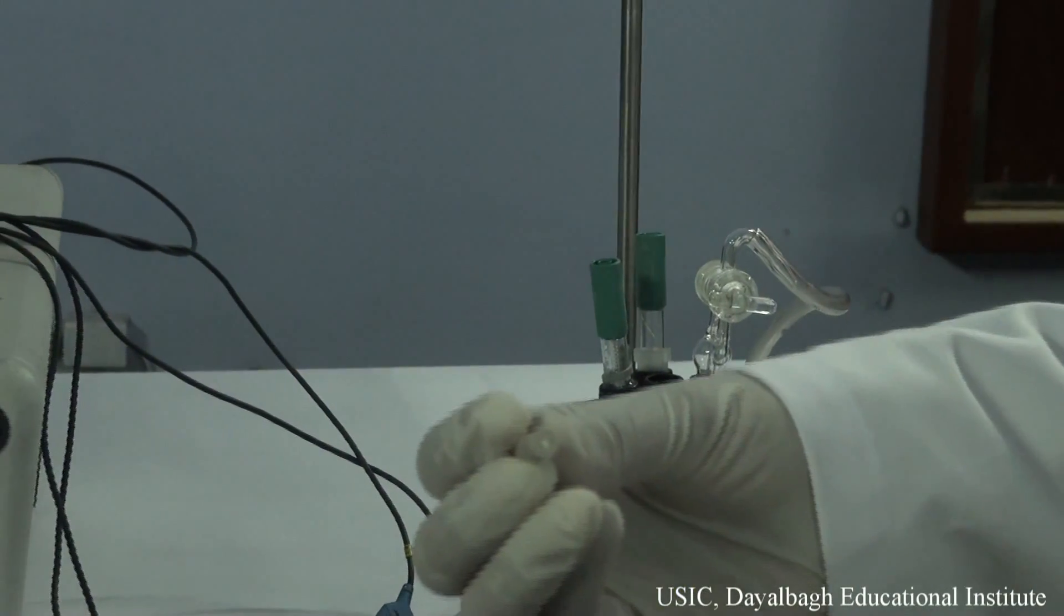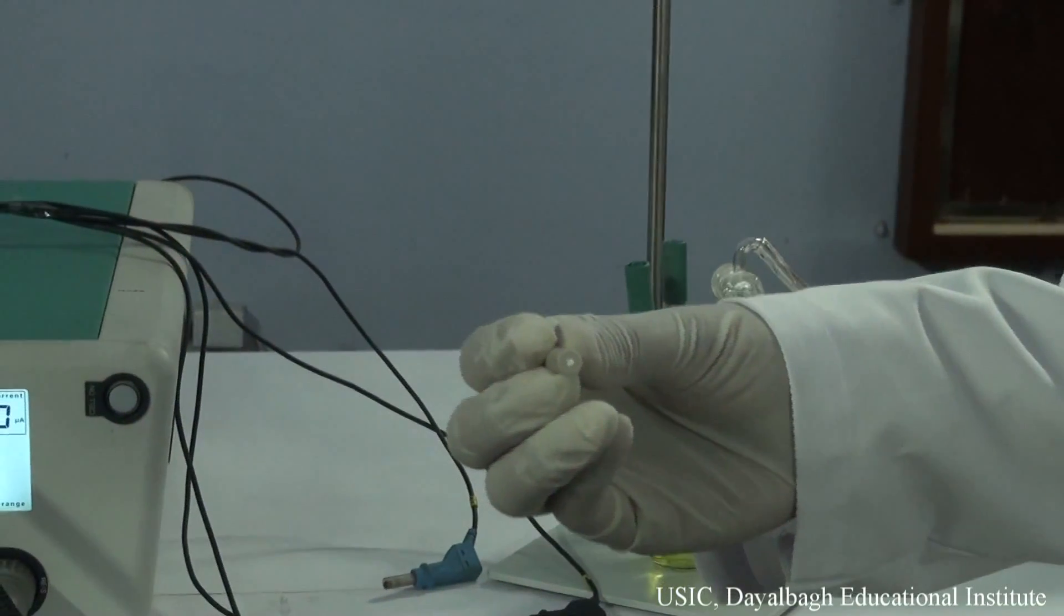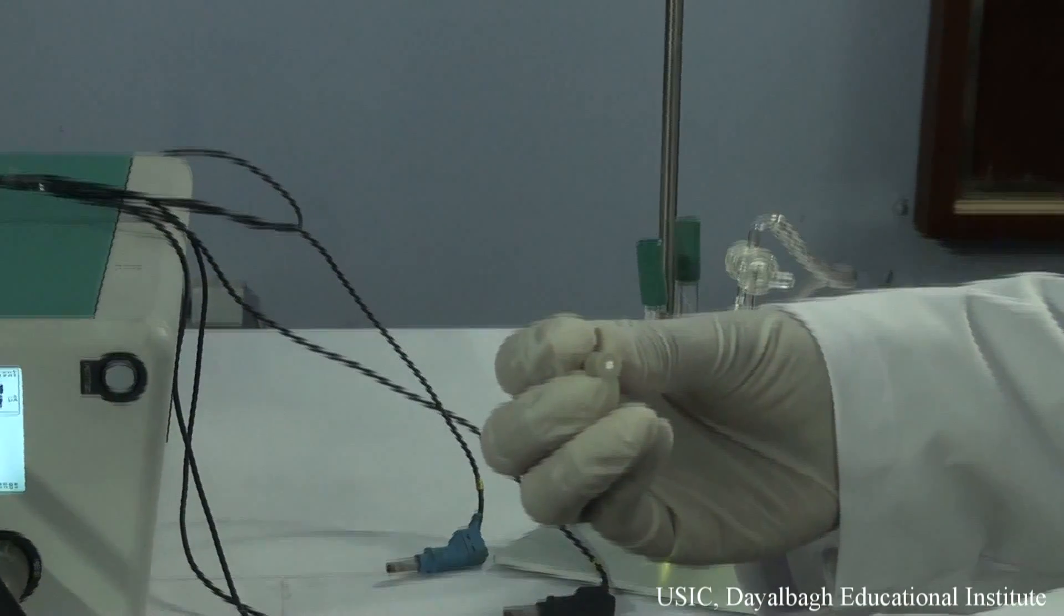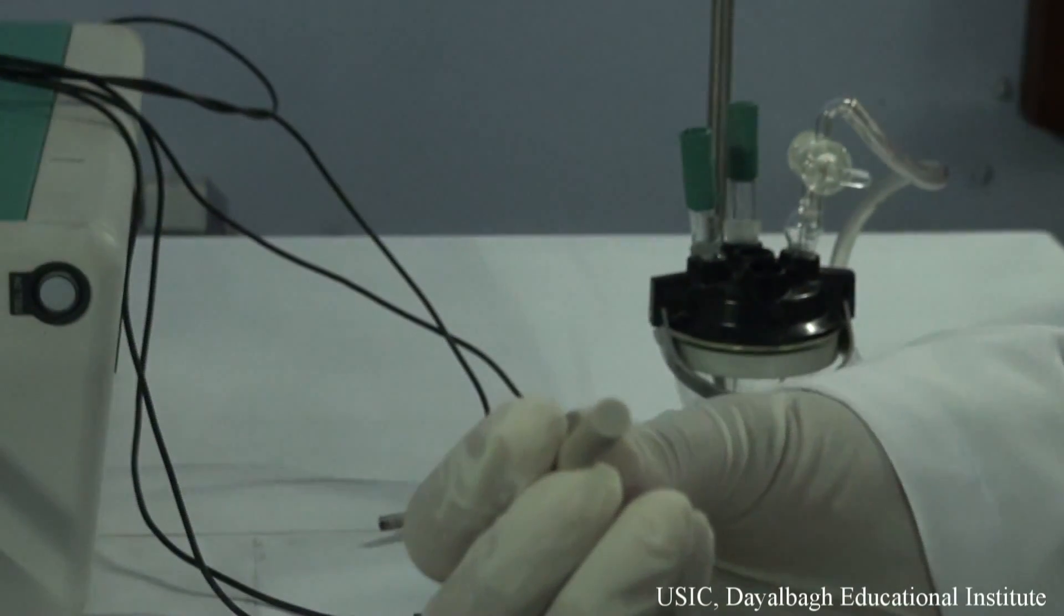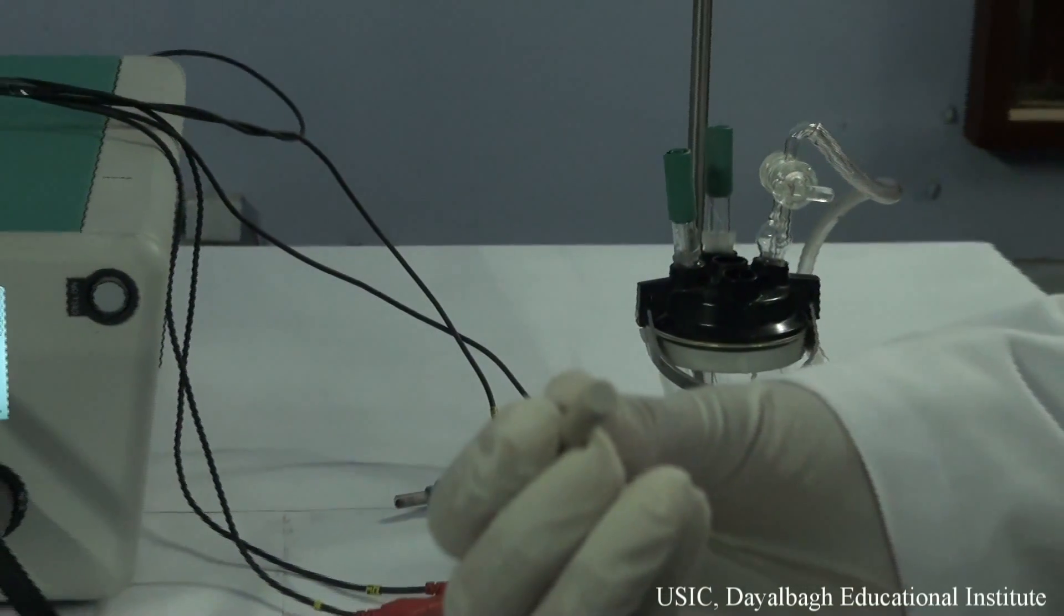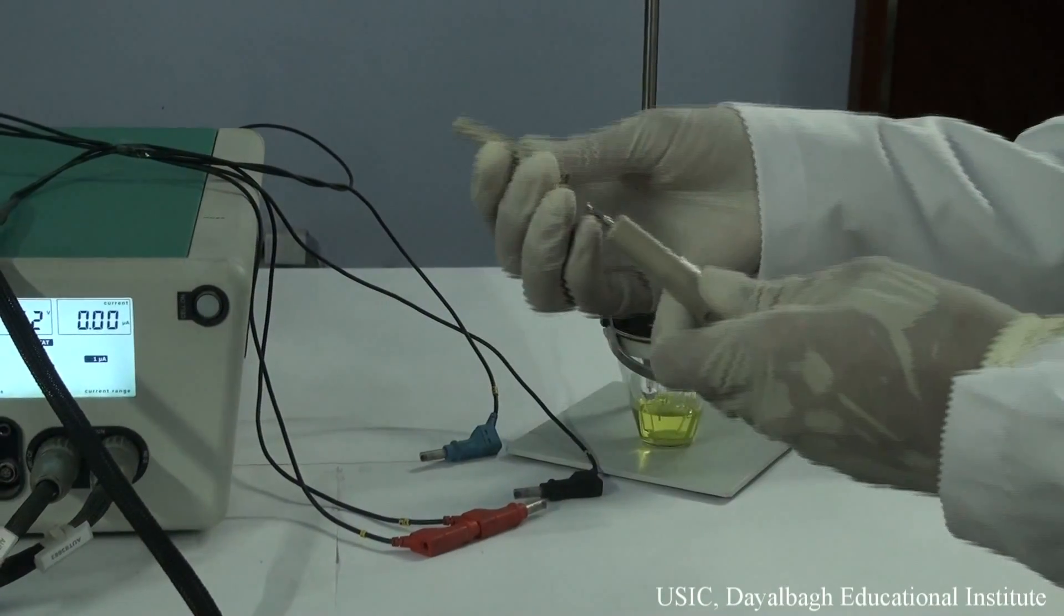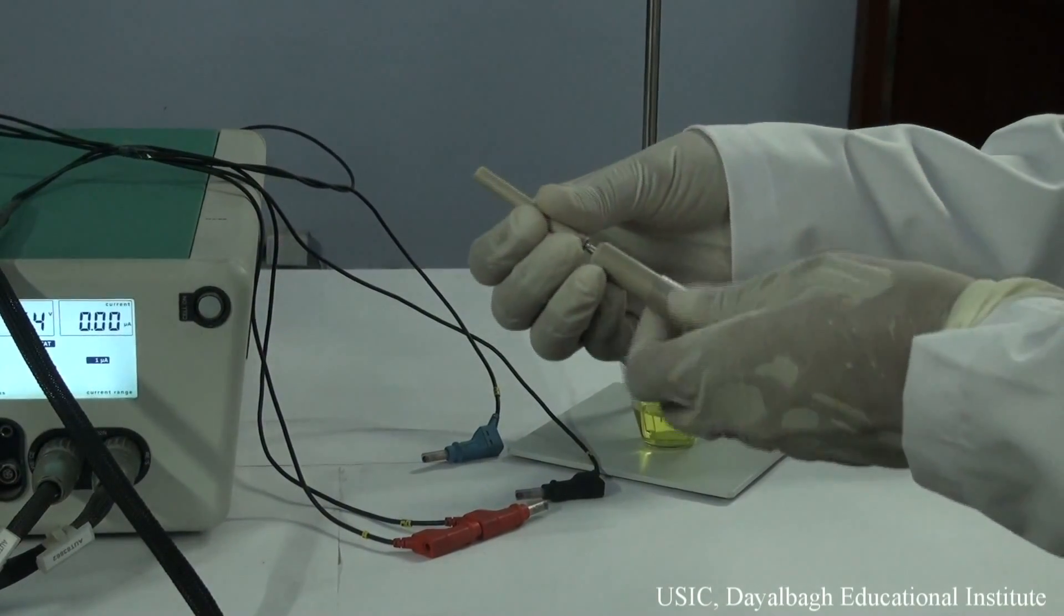And the electrode which we are using is the platinum solid electrode for the study of ferricyanide solution. We can see the surface of the platinum electrode. We keep this in a holder.